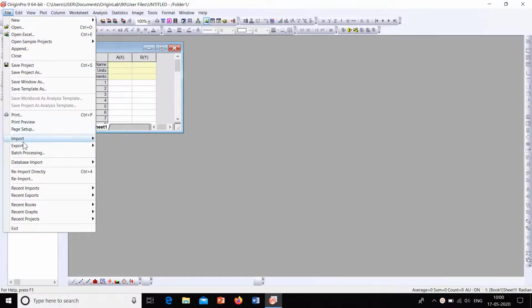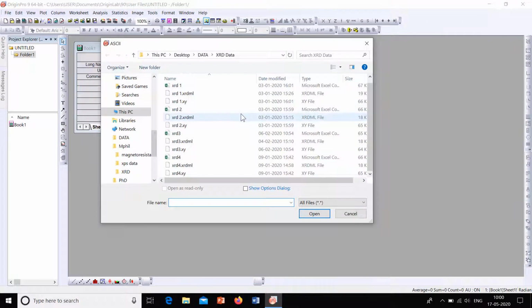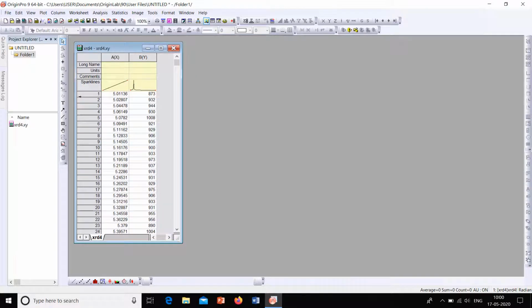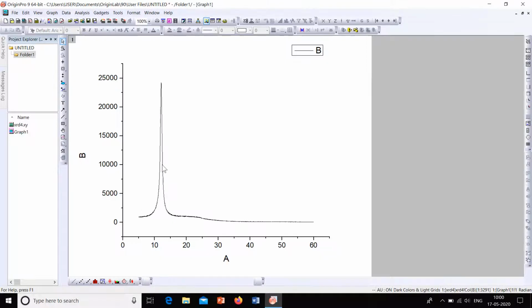So first of all, let's import an XRD file, or any of the files that are needed. Let's select XRD4. So now our XRD is ready. I have selected a simple XRD with a single peak, so I'll show how it is done with a single peak. You can do it if you have many peaks as well by selecting each peak. First let's draw the plot without any template also. Okay, this is the XRD plot that is here.